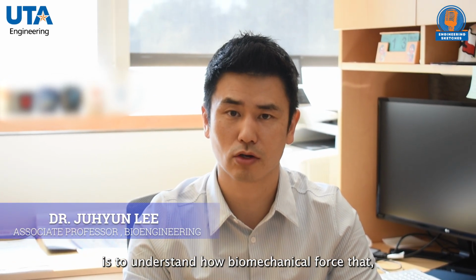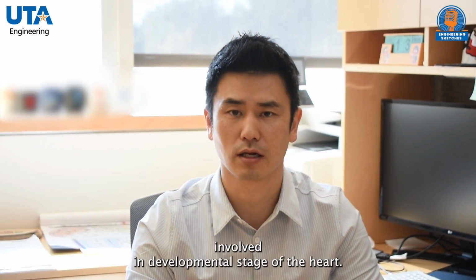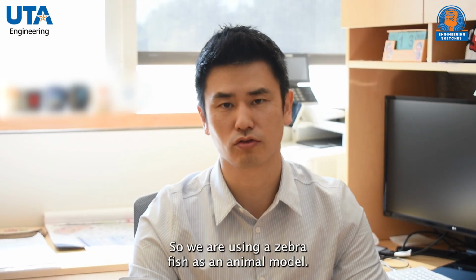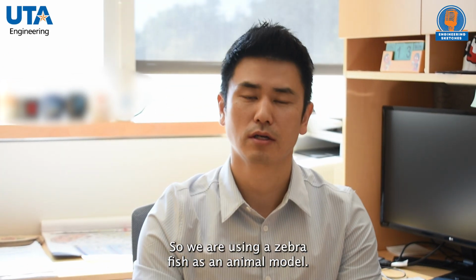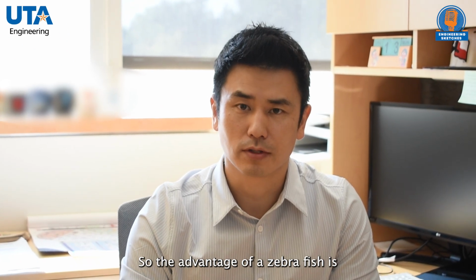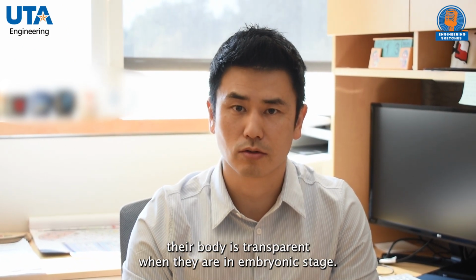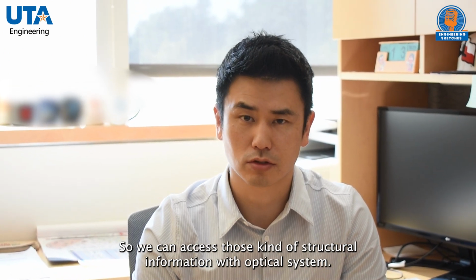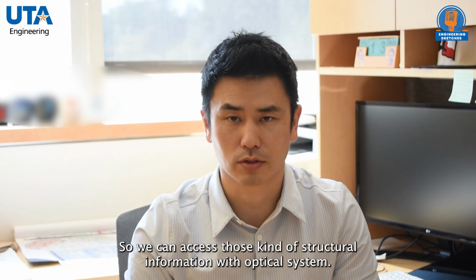So my main research theme is to understand how biomechanical force is involved in the developmental stage of the heart. We are using zebrafish as an animal model. The advantage of zebrafish is that their body is transparent when they are in the embryonic stage, so we can access structural information with an optical system.